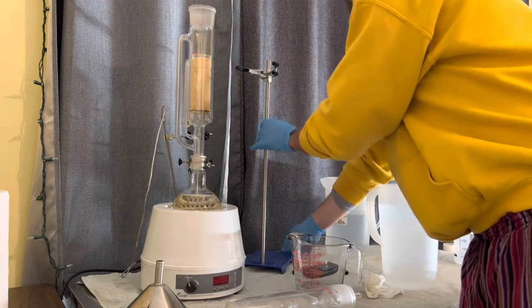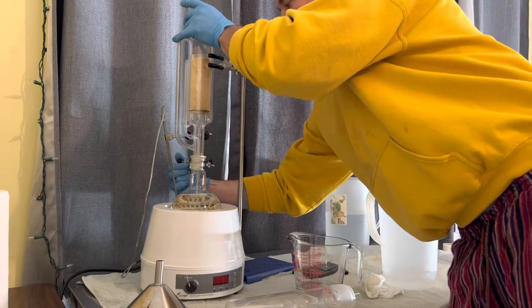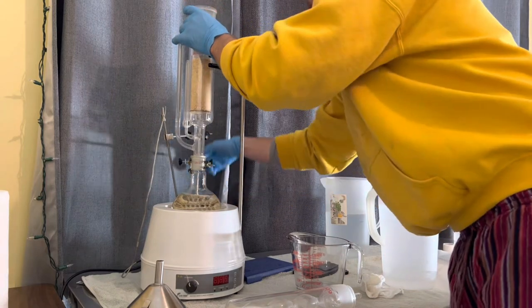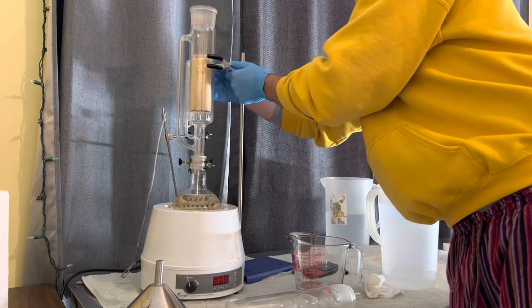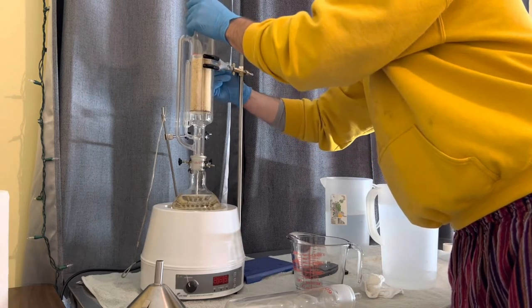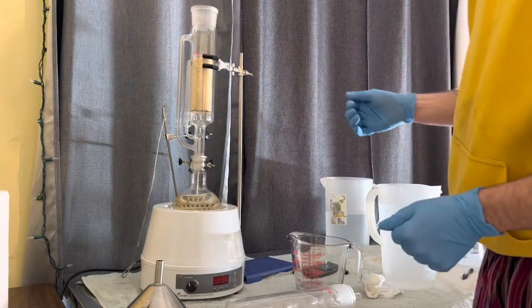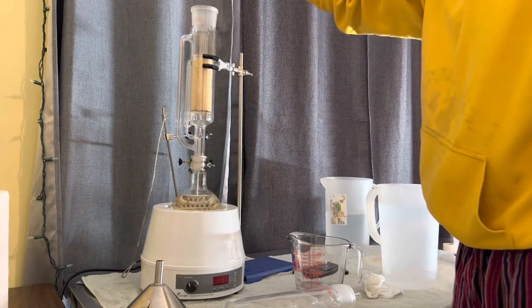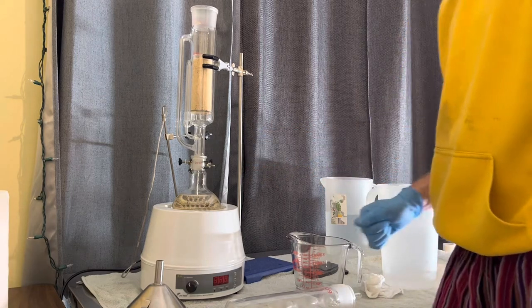And once we have our main chamber and thimble loaded and in place, I'm going to bring this back a little bit. We want to close these clamps. These help keep everything in place so it doesn't go tilting on you. And with the larger ones, and depending on your setup, you want to have one on this, and if you can, one on the condenser. I guess that's personal. So far, I've had no issues, fortunately.